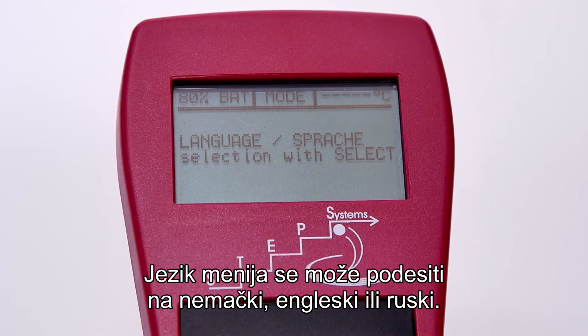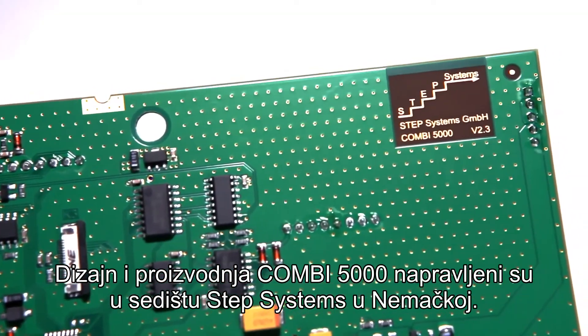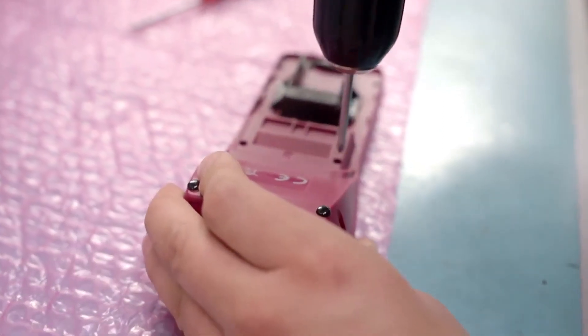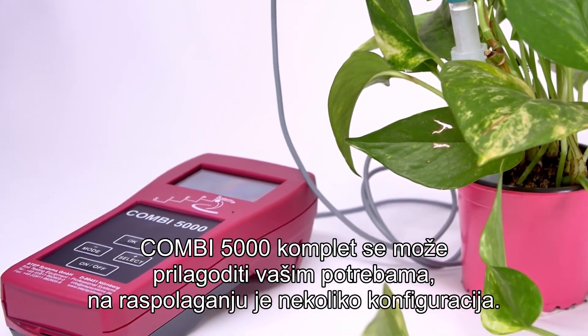The language of the menu can be set to German, English, or Russian. The complete development, design, and production of the COMBI 5000 has been made at the headquarters of STEP Systems in Germany. The COMBI 5000 kit can be customized to your needs — several configurations are available. Please contact us for more information.